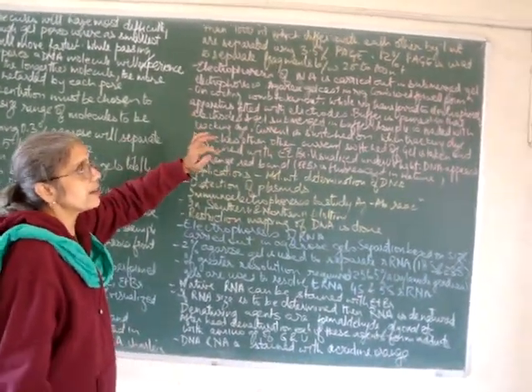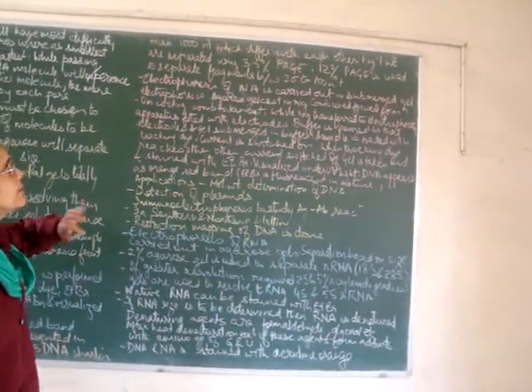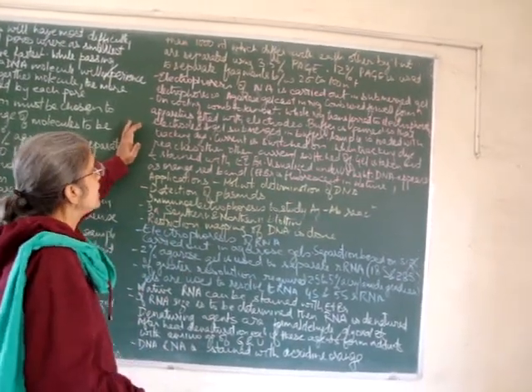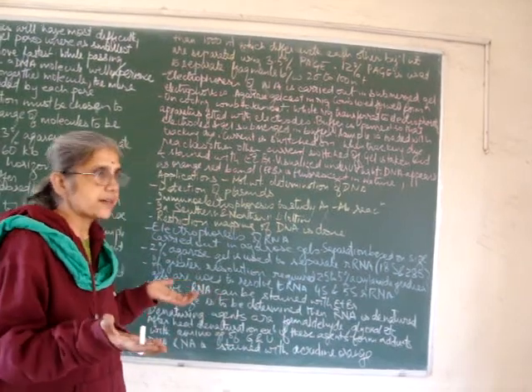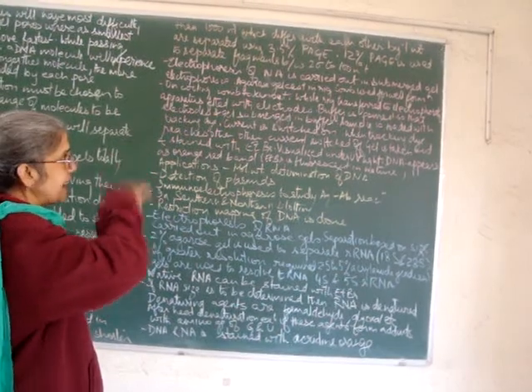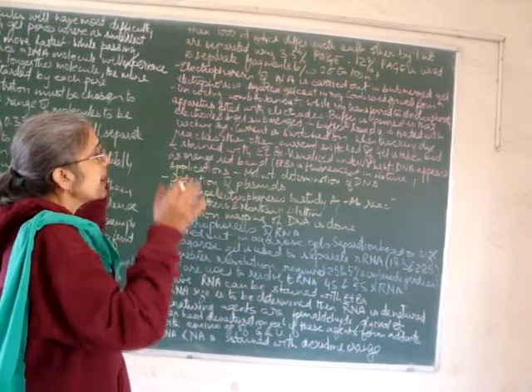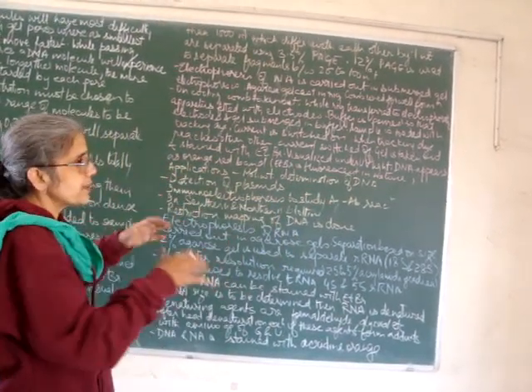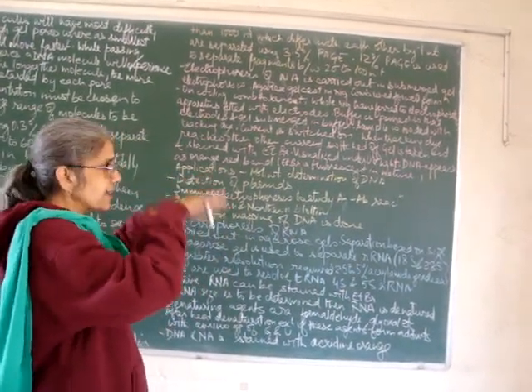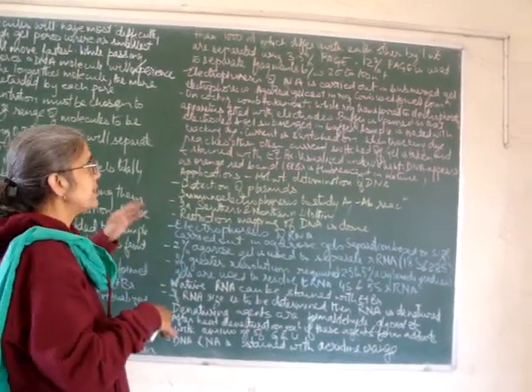12% polyacrylamide gels are used to separate fragments between 20 and 100 nucleotide units. Electrophoresis of nucleic acid is carried out in submerged gel electrophoresis. Agarose gels are cast in a rig, and when the gel is still in molten form, a comb is applied so that it etches the wells in it. When the gel has solidified, the comb is removed and the whole rig along with the gel is transferred into the electrophoretic apparatus. Buffer is filled till the gel and the electrodes are submerged. Then the sample is loaded.